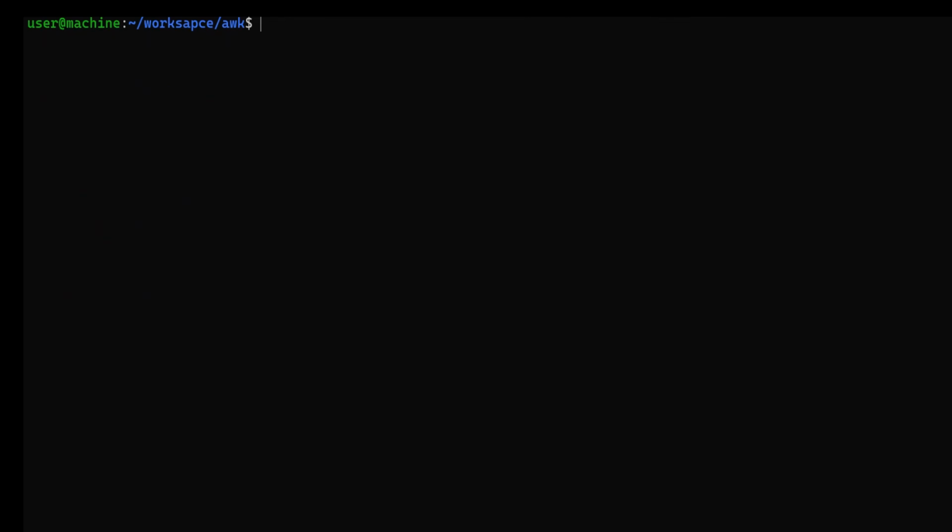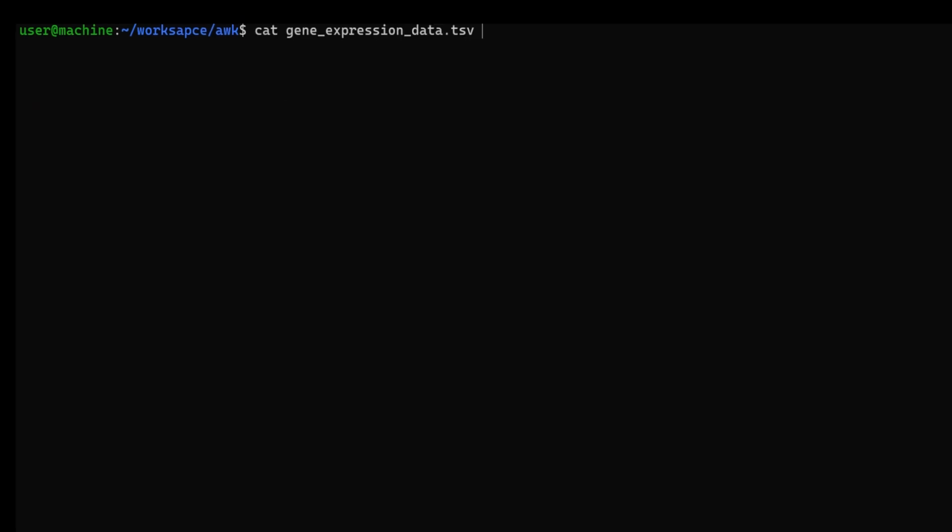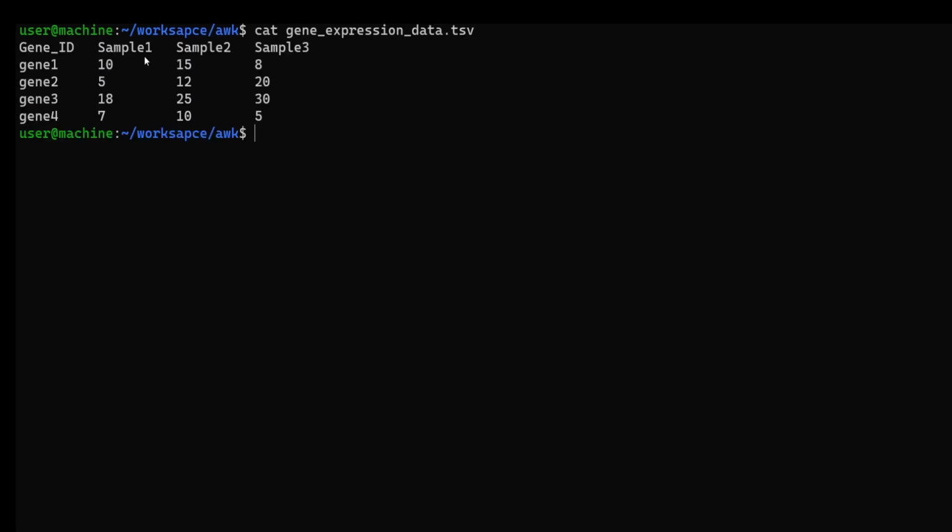So now let's check how many genes for each sample with reads count more than 15, let's say. So I will use AWK.